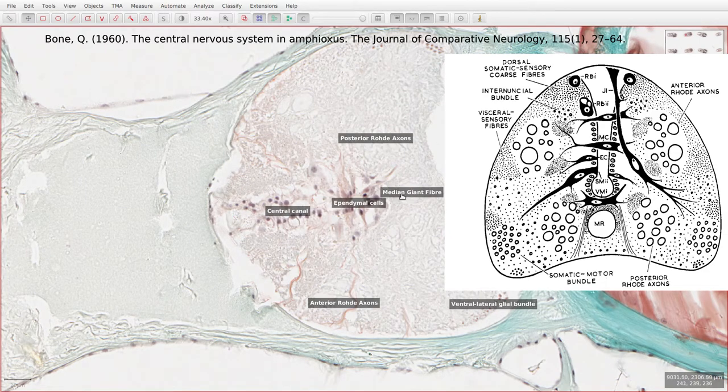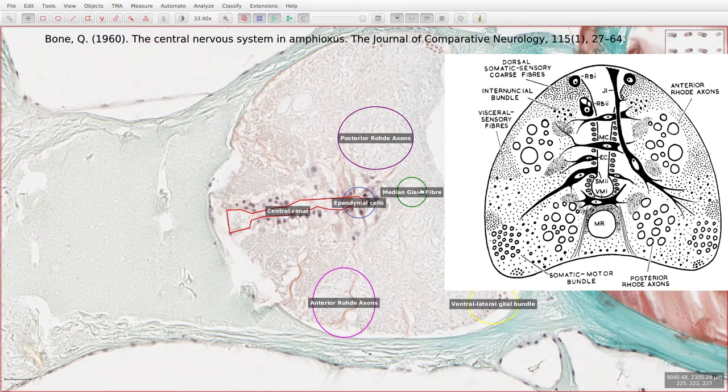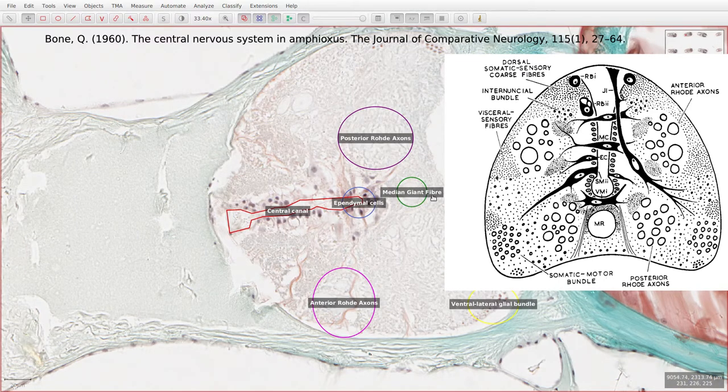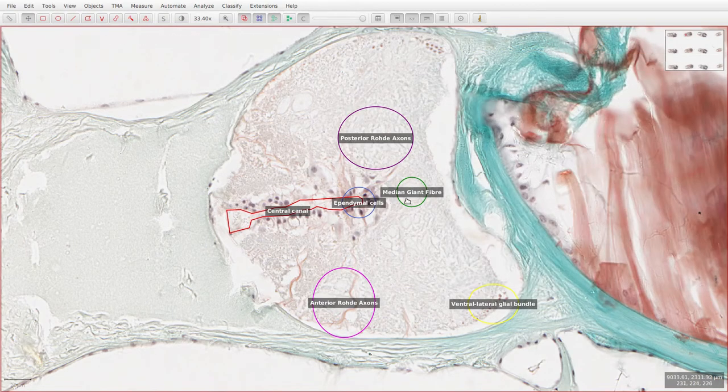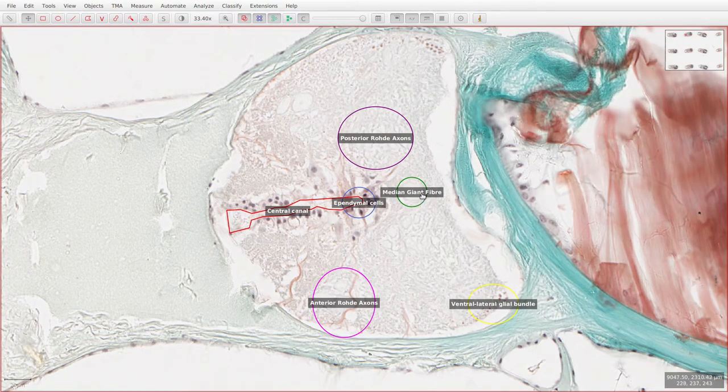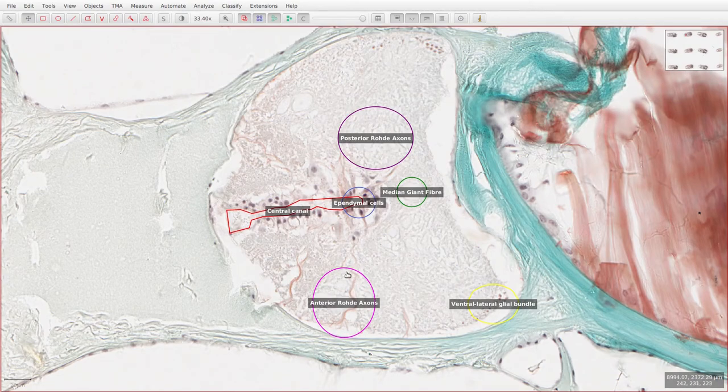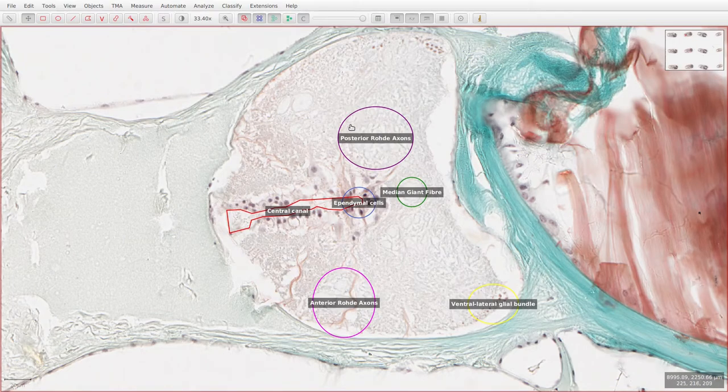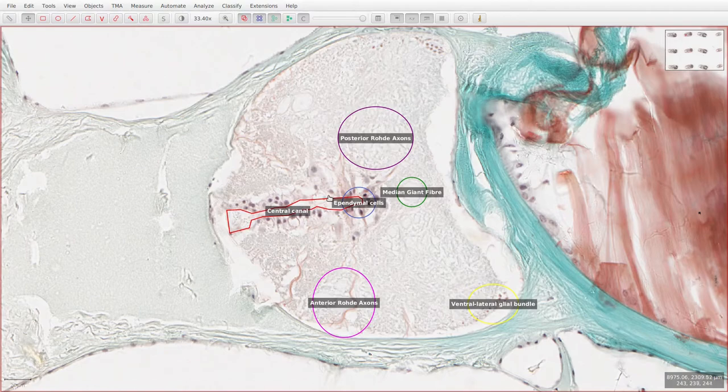This median giant fiber originates at the most anterior Rohde cell and passes all the way down the body of the amphioxus. And these bundles of axons have been given names, for example this is the anterior Rohde axons and these are the posterior Rohde axons. These Rohde cells are going to be playing some part in the swimming mechanism of the amphioxus.